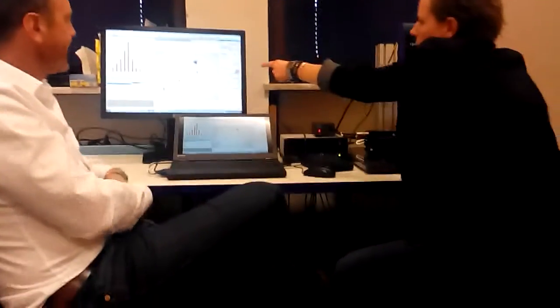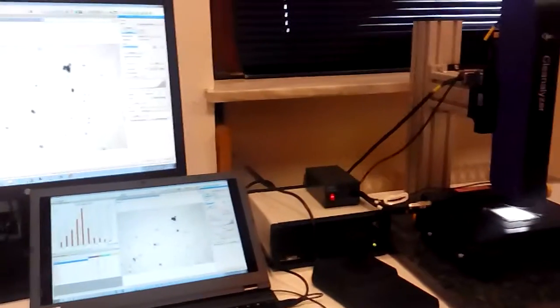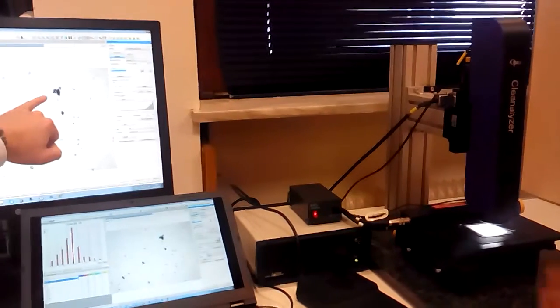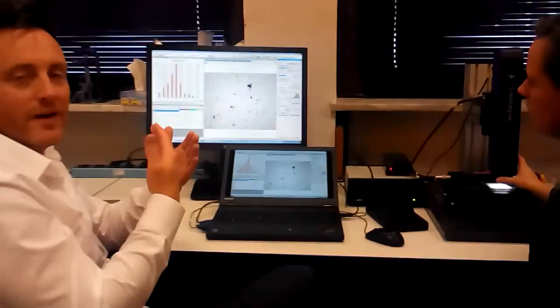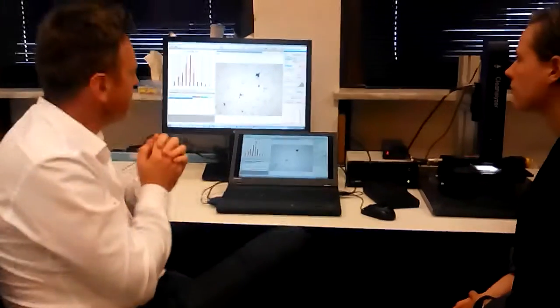Maybe you can see it already here. We have the polarizer on, so it suppresses the reflection, and here you can see that it's reflecting, so it should be a metal. So the software will detect that from pass 1 to pass 2, the reflection properties of that particular particle changed, so it's very likely that that is a metallic particle due to that performance.